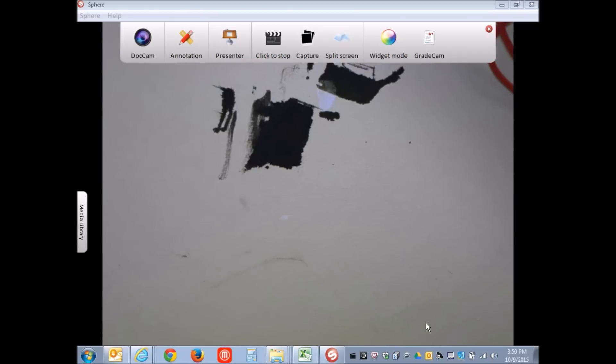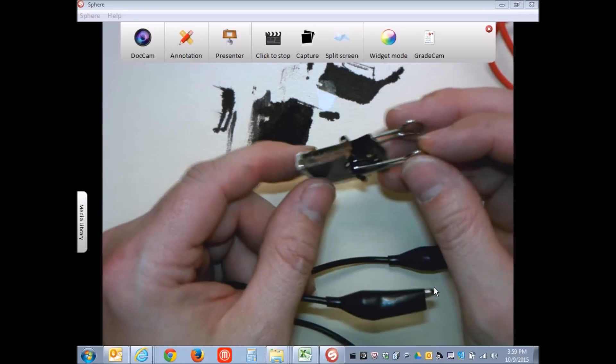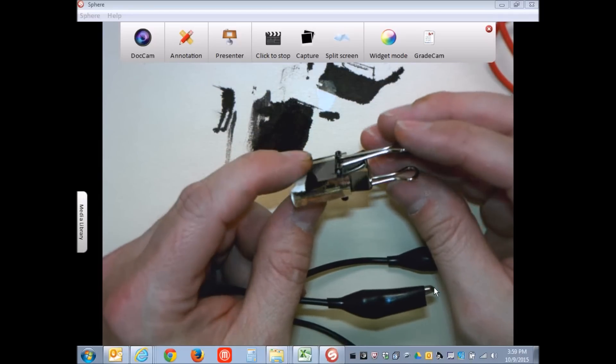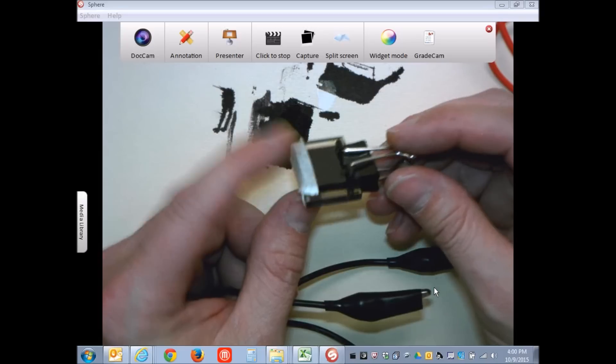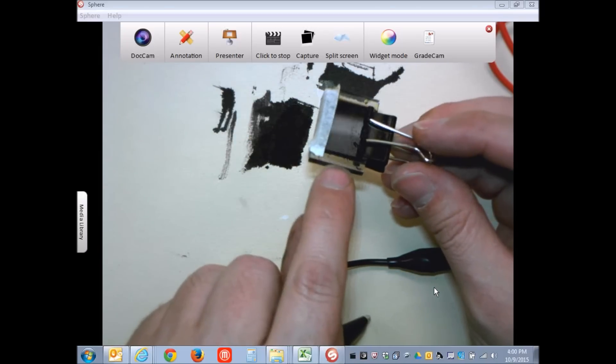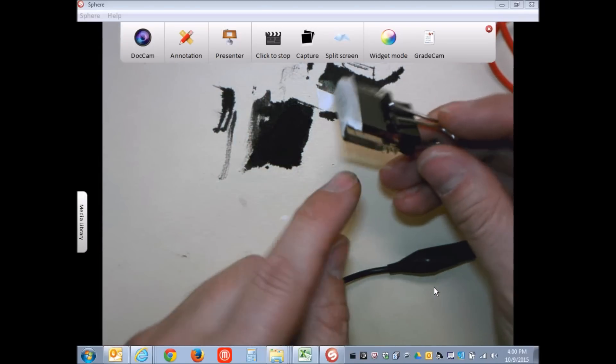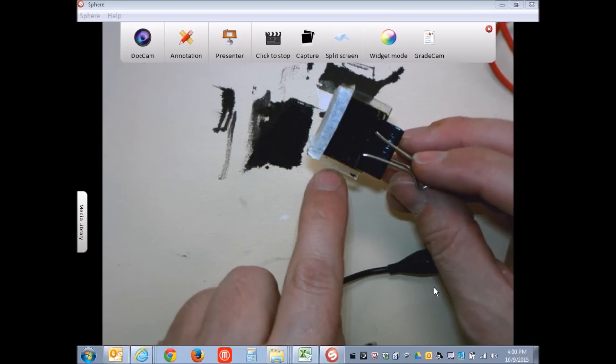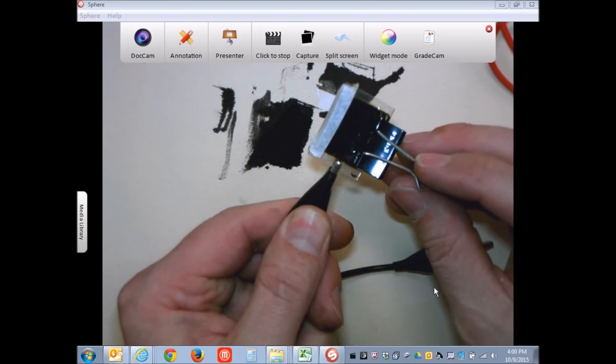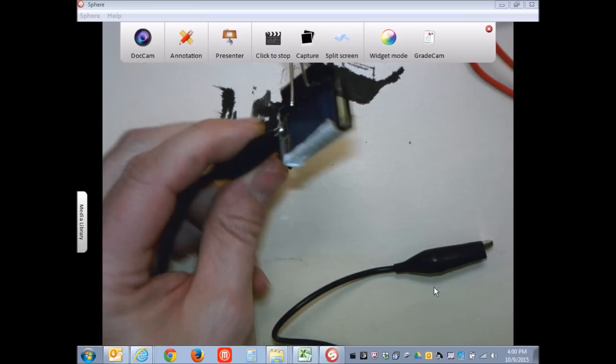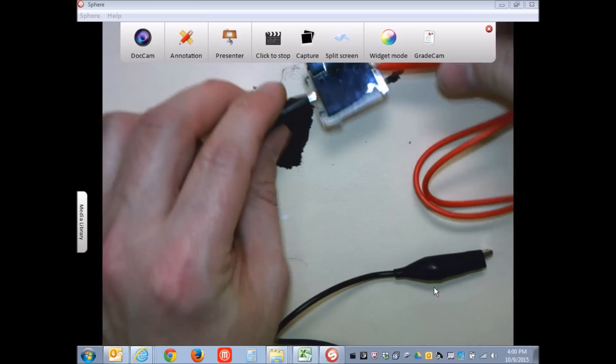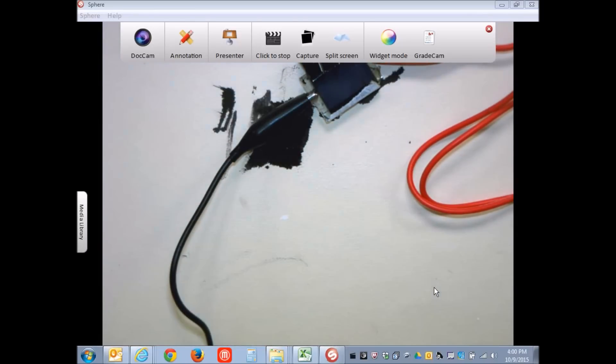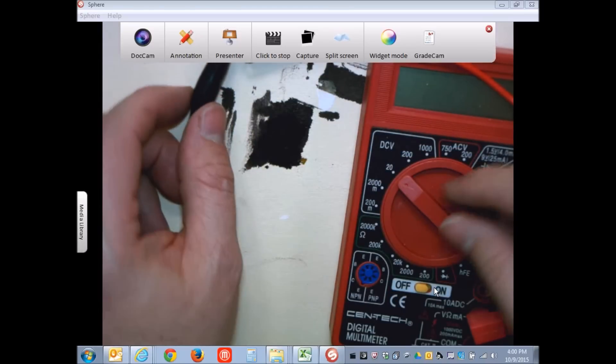So we've closed the cell, carefully rubbed off the iodide without cutting ourselves on the glass edges, so be very careful, or wear gloves. And you can see we've offset the cells on each side so that the conductive glass, the smaller portion of conductive glass sticks out each end. Now I can connect alligator clips to each end of the slide, which then can be connected to my multimeter. Now you're ready to go test.